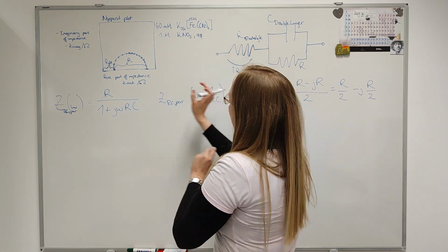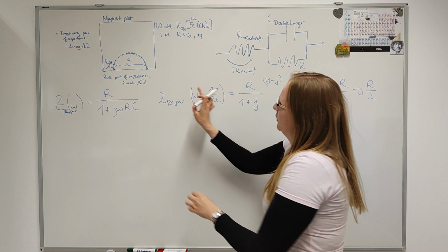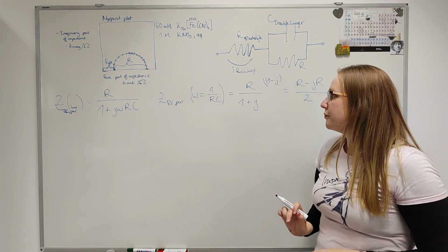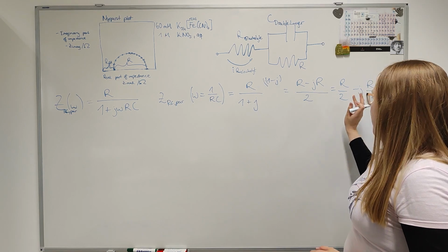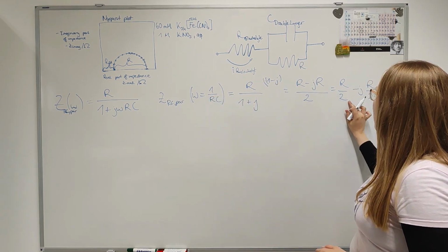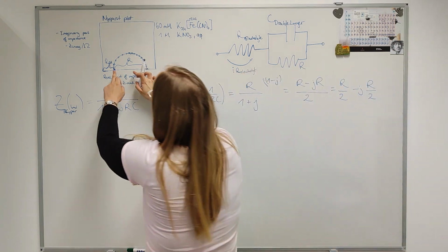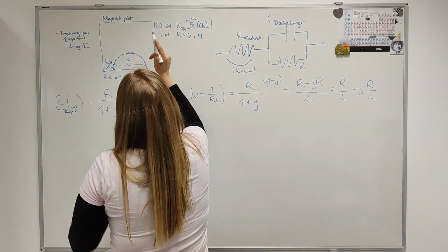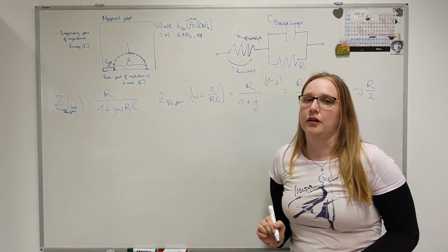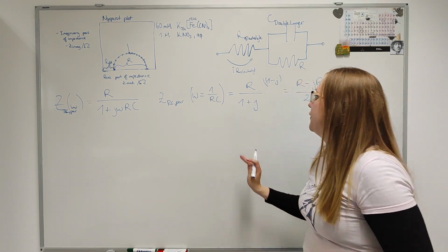So separating our electrolyte, we here have the diameter of the semicircle, on the real axis, as the resistance. So if we know that, we can see that we have the specific point here for half of the resistance in the real part and half in the imaginary part. So where we arrive is the vertex of the semicircle, and this we can easily read off from our impedance spectrum.